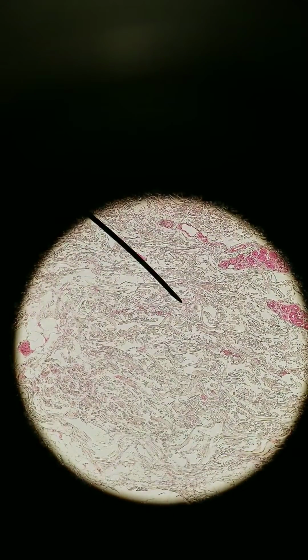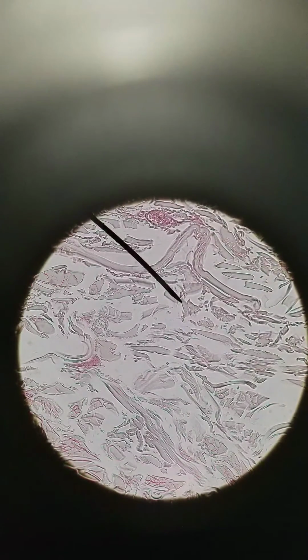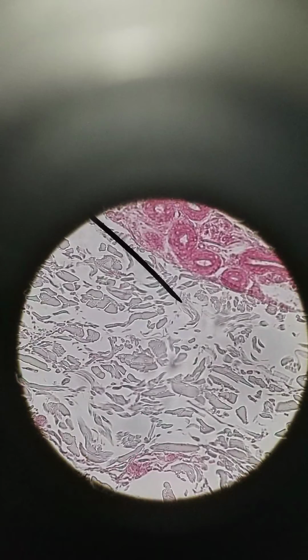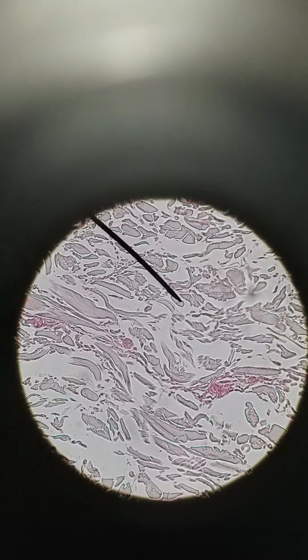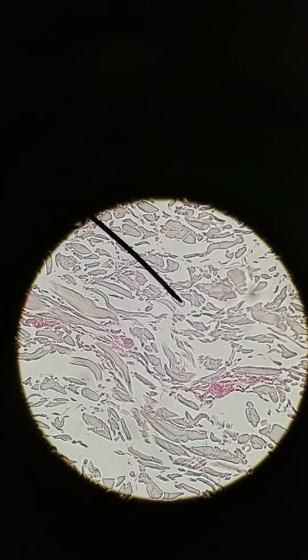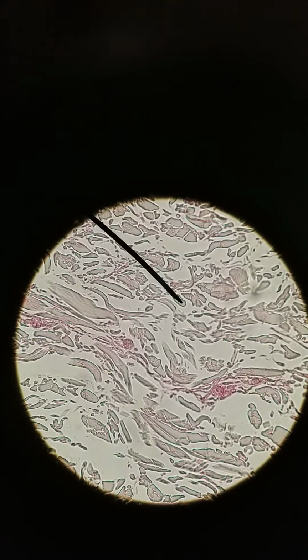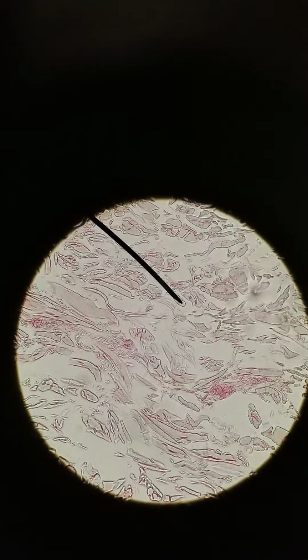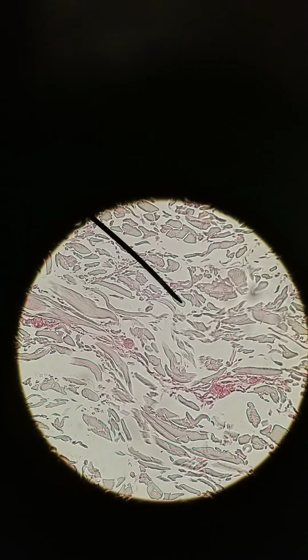This is 100x, excuse me. Let's go to 400x total, and you can see how the collagen is cut in many different directions. Some are in cross sections, some are longitudinal, and a lot are obliquely cut. Dense irregular is also strong, but not as strong as dense regular, but this provides multi-directional strength. Dense irregular is a great cushion for multi-directional forces.